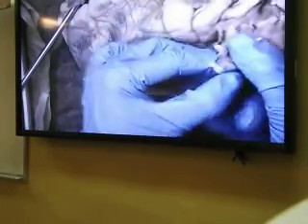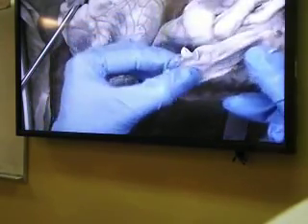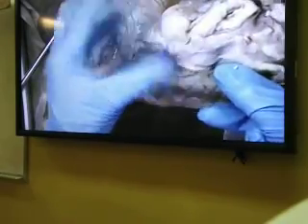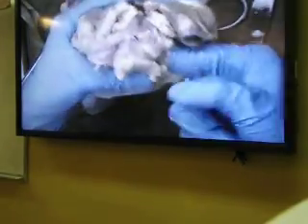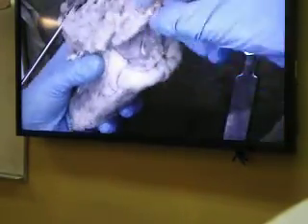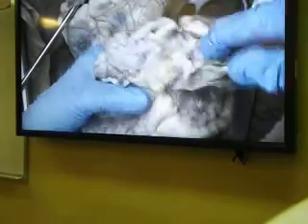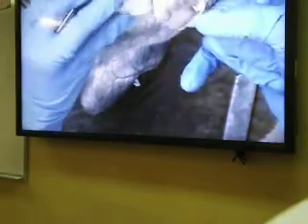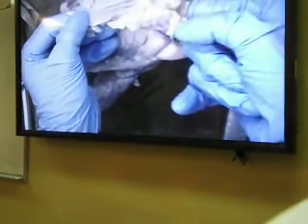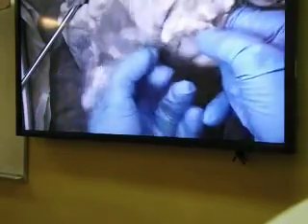So in those times, if your inferior vena cava is too long and it's covered with fat, you want to cut a tiny bit of fat so that the inferior vena cava is exposed. Otherwise, the hole will not be exposed, and our finger sometimes is not long enough to go through it. But you understand, this is the superior vena cava, because it's the beginning and going to the right atrium, and wherever it is coming out, which is at this end, this has to be the inferior vena cava. And sometimes it will come out not directly this way, but go a little bit on this side.